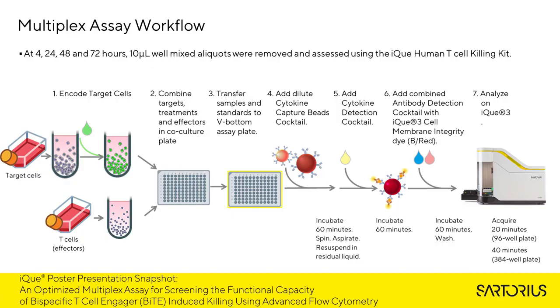The total assay time for each time point is just over 3 hours, and the total acquisition time is about 20 minutes for a 96-well plate. The advantage here is that the same culture plate can be utilized for multiple time points across a time course of several days.